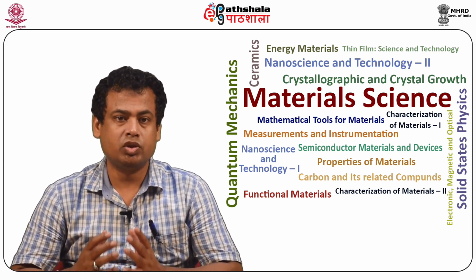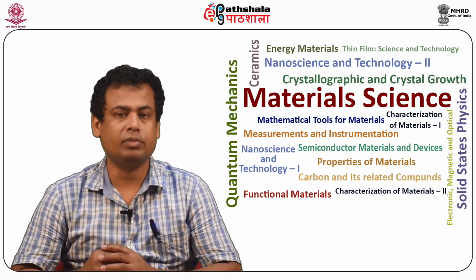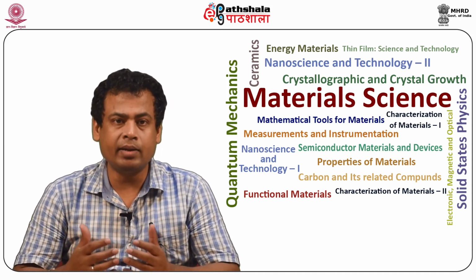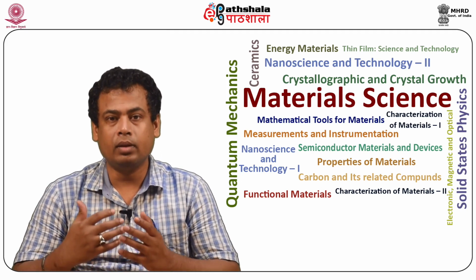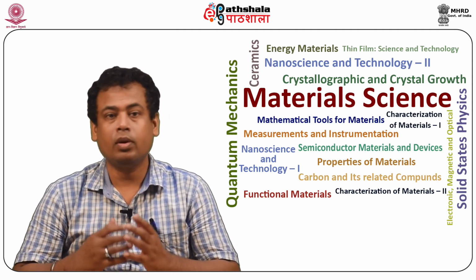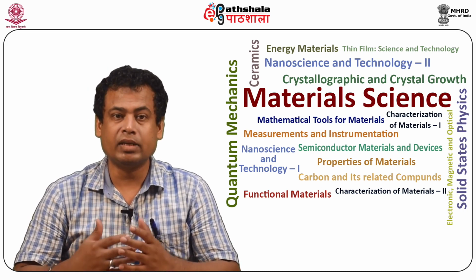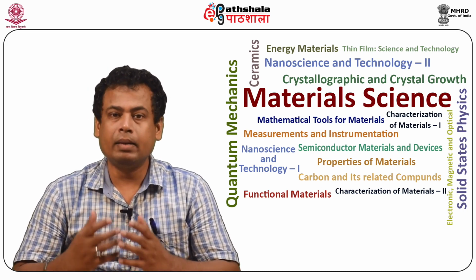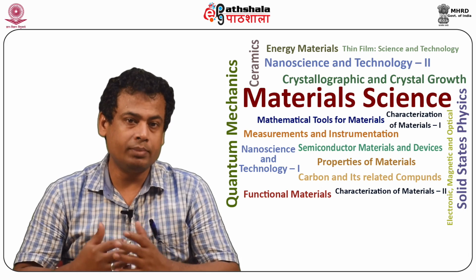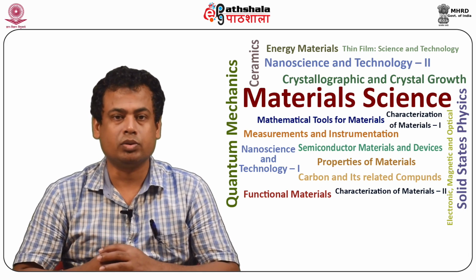Any debris sticking on the fine tip of the filament will cause a reduction in emission. Thus, the microscope needs to be baked out routinely to maintain a clean electron gun. Another disadvantage of field emission is long acquisition times during X-ray analysis. A field emission gun will not generate many X-rays, since low beam currents and small beam diameters are generally used.